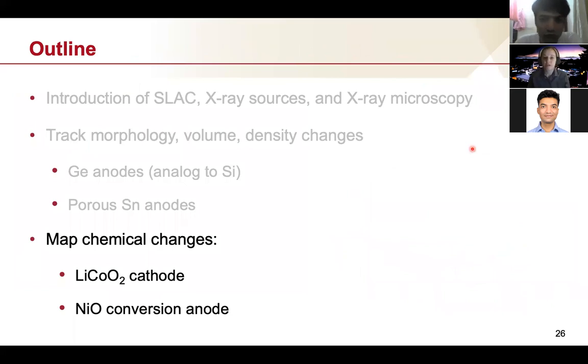Okay, in the remaining part of the talk, I would like to look at chemical imaging because I talked a lot about being able to tune the X-ray energy, and we can then use that to combine spectroscopy with microscopy.